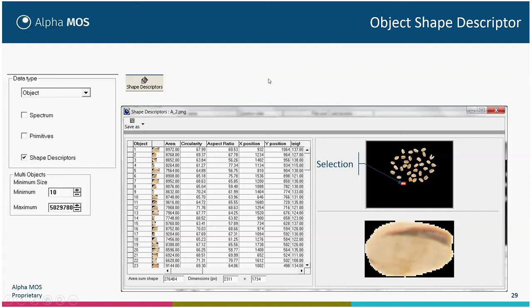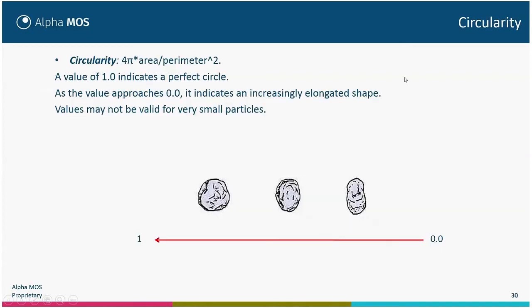This is very powerful to analyze the color and shape of every single object. Circularity indicates the shape of the object: a value of one indicates a perfect circle, and a value of zero indicates a very elongated shape. You can see that depending on the shape of the object, you will have a circularity close to one or close to zero. Note that the value may not be valid for very small particles where the number of pixels is very low.